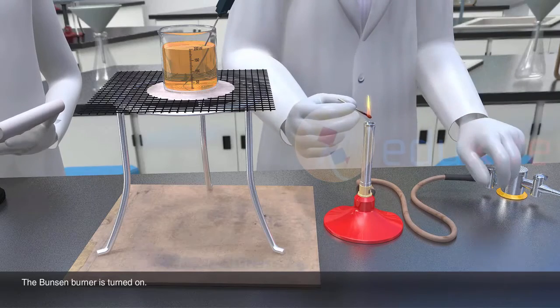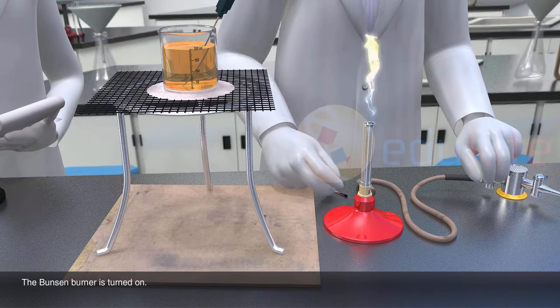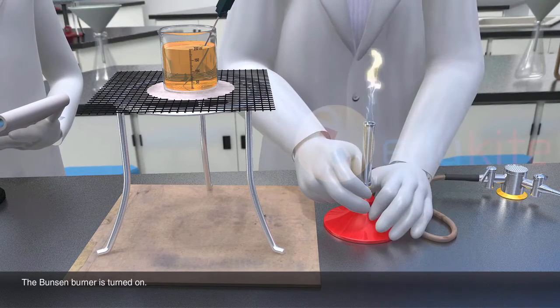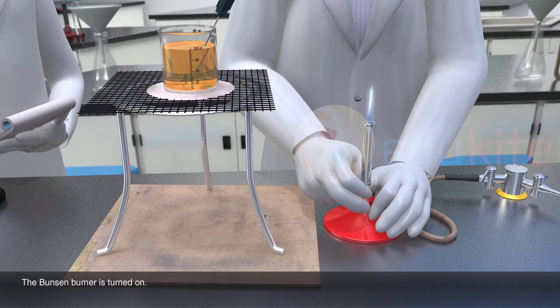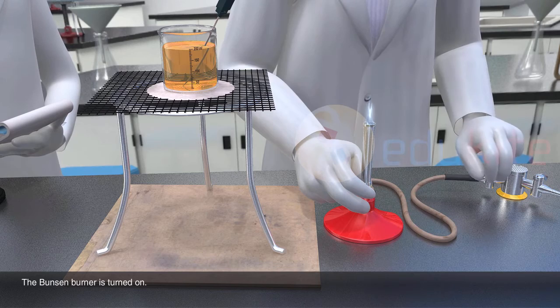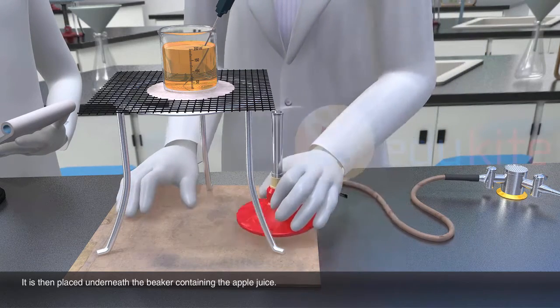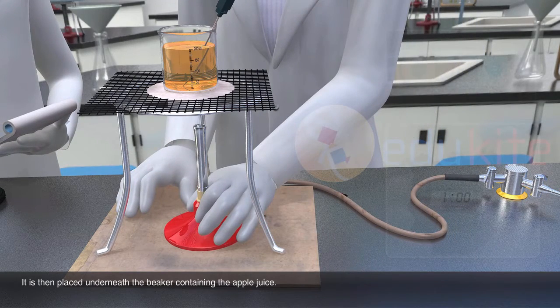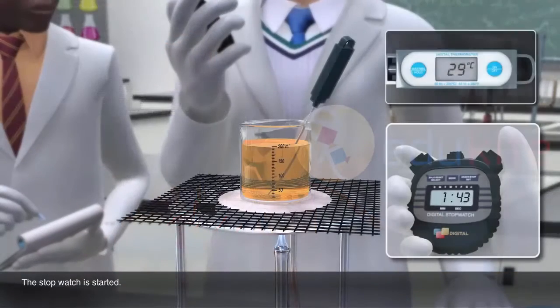The Bunsen burner is turned on. It is then placed underneath the beaker containing the apple juice. The stopwatch is started.